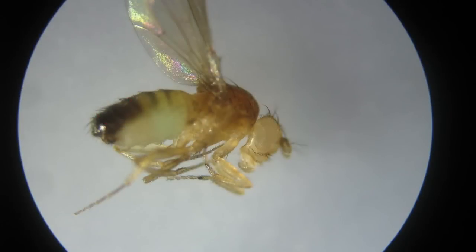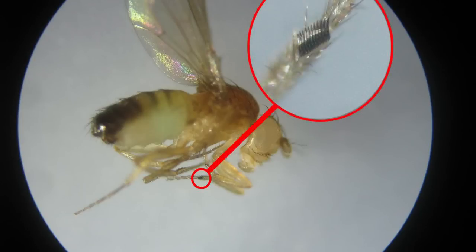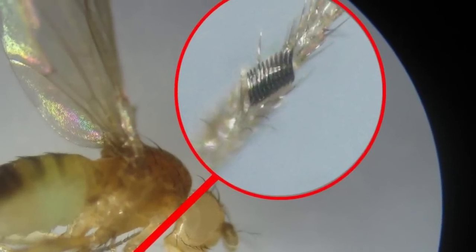Male flies also have a small black comb on their front legs. Under a hand lens, this appears as a black mark. But under a microscope, the comb is clearly visible. The female fly does not have this structure.